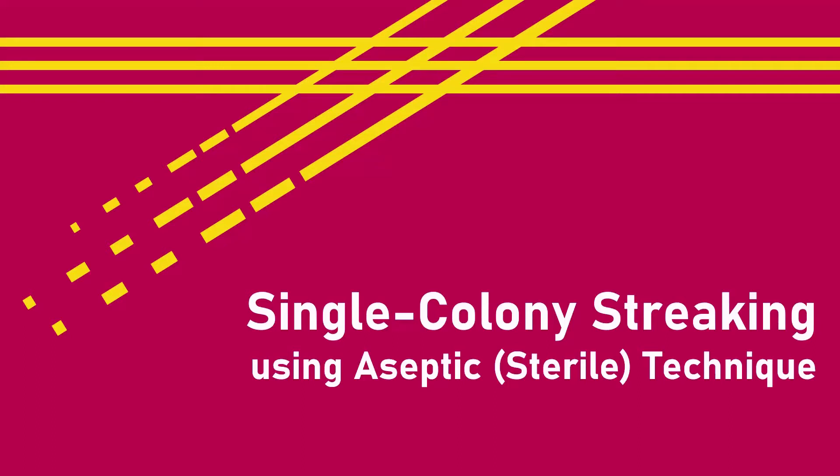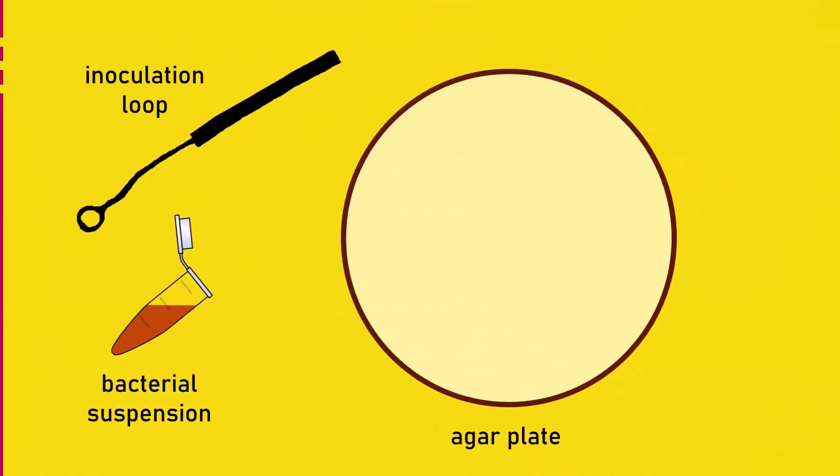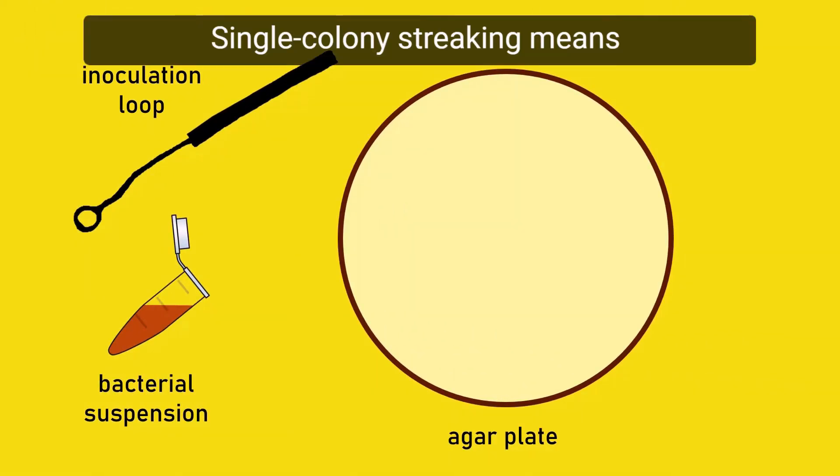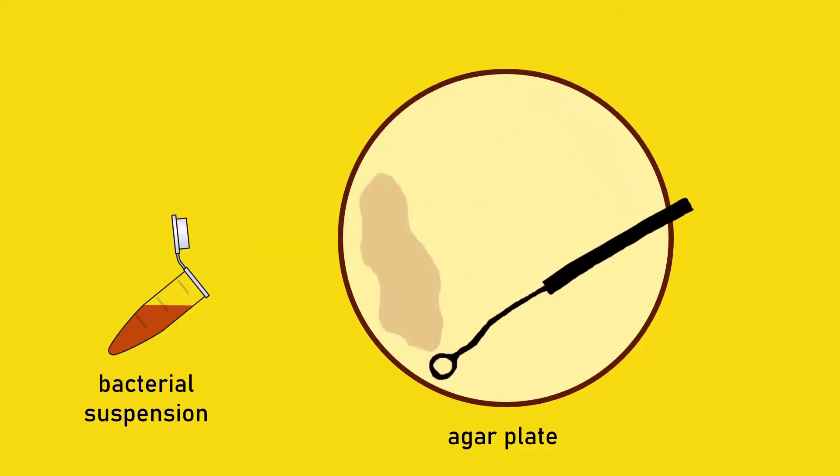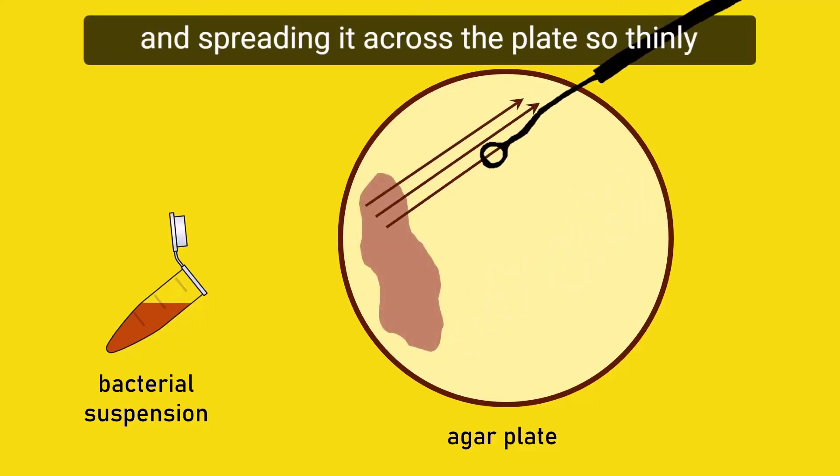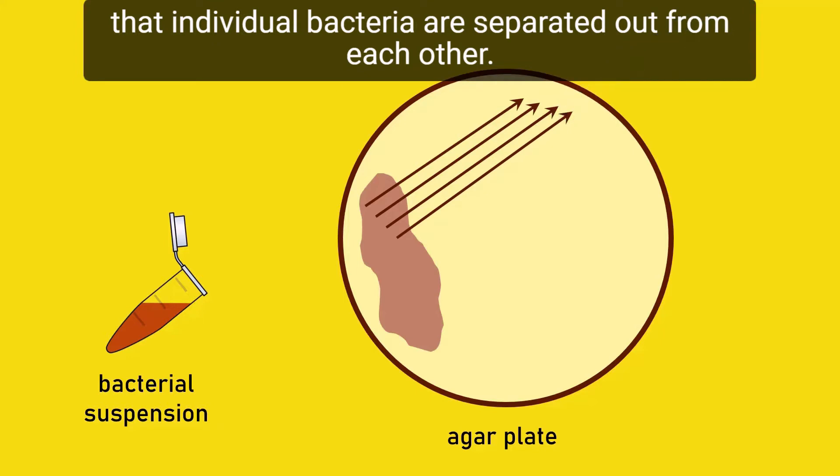Single colony streaking using aseptic sterile technique means taking a sample from a suspension of bacteria, adding it to an agar plate and spreading it across the plate so thinly that individual bacteria are separated out from each other.